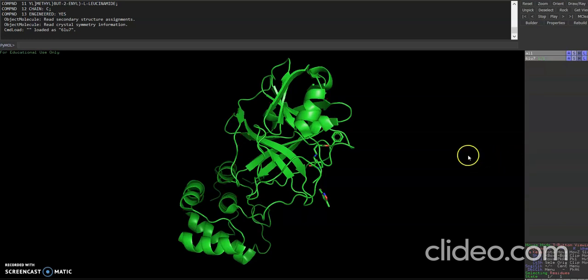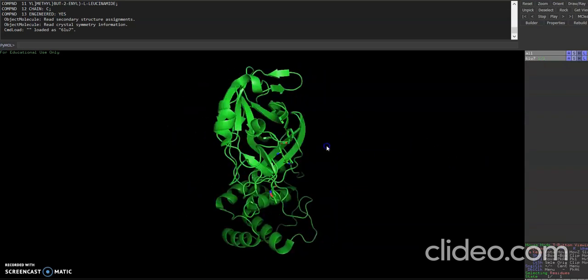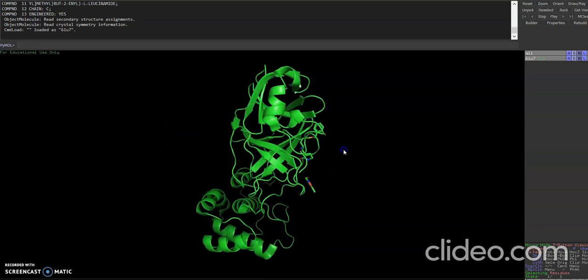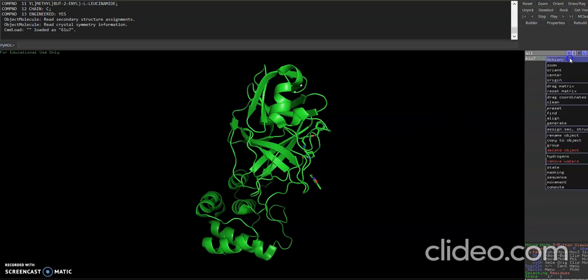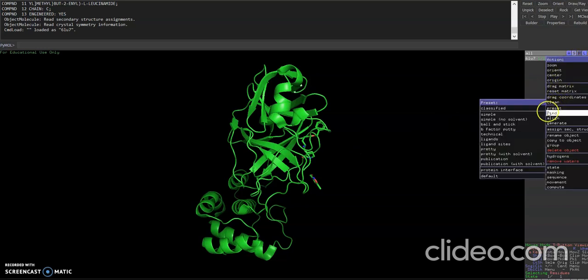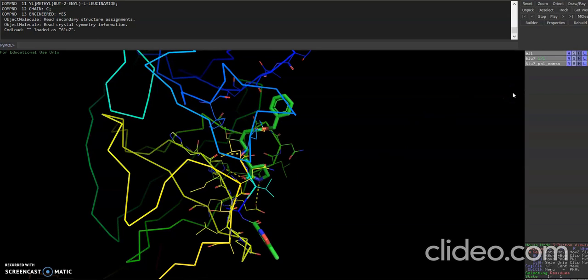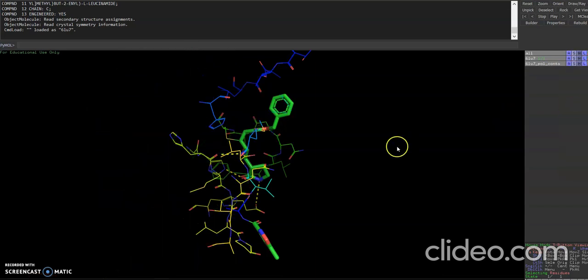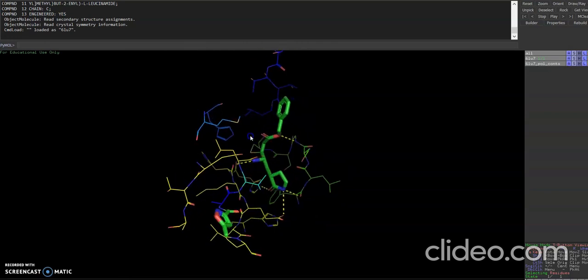And we need the residues which are around the inhibitor. So for this you go to actions again, select preset and ligands. Now you can see the view is better. Still you can make the view more clearer by hiding the protein backbone which is right now in the ribbon form. For that you need to go to hide and say ribbon.